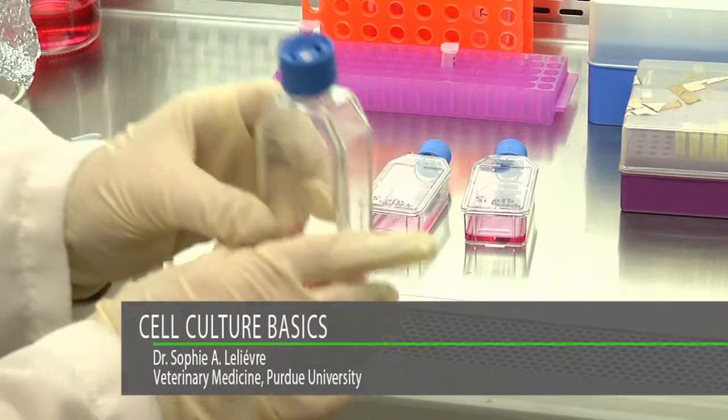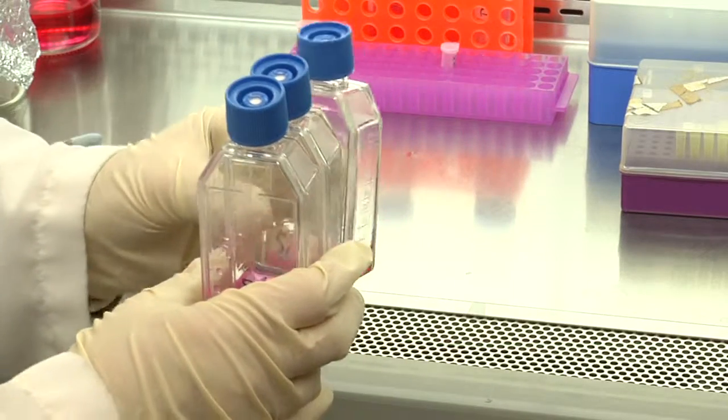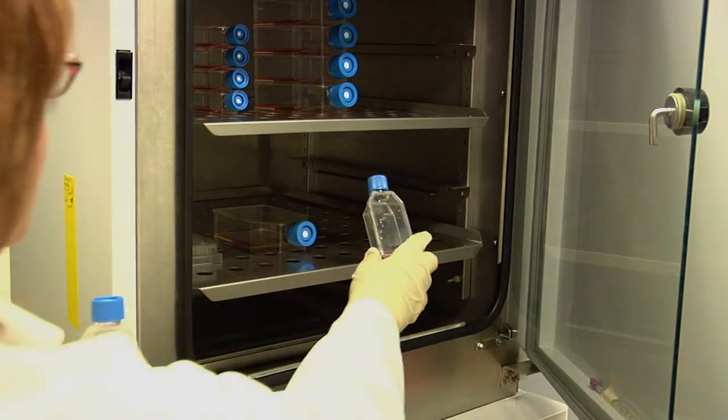Once flasks are ready to be placed into the incubator, you should carry them straight in order to prevent the medium from coming in contact with the lid. Carefully place the flasks flat on the surface where the cells are attached or will need to adhere if you just seeded the cells.